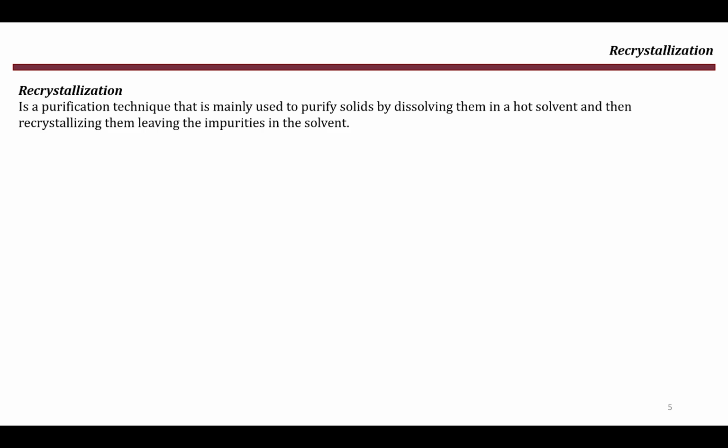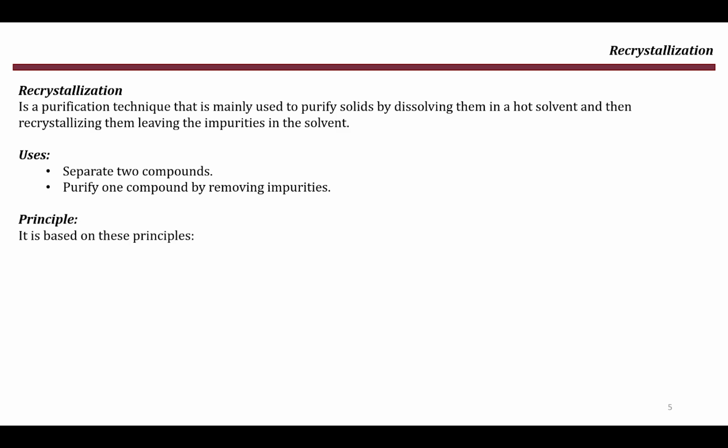We will explain the steps of the recrystallization technique in the upcoming slides. For now, usually it is used to separate two compounds, and we will explain this in a minute, or to purify a compound by removing the impurities from this compound. Now, what is this technique based on? It is basically based on these principles.